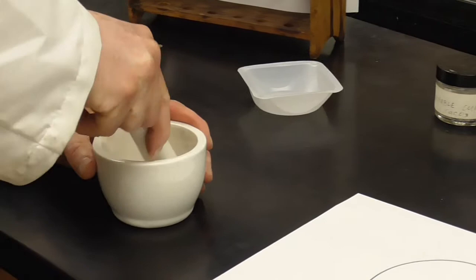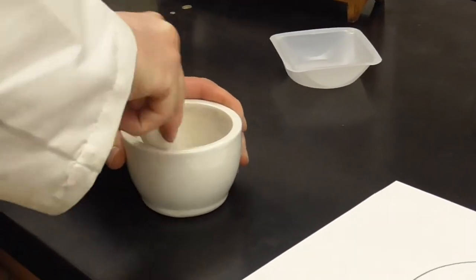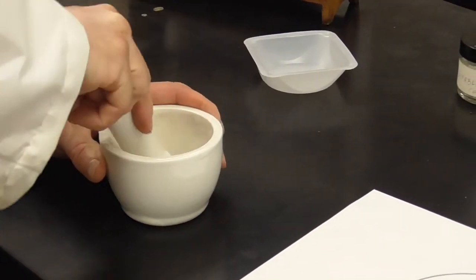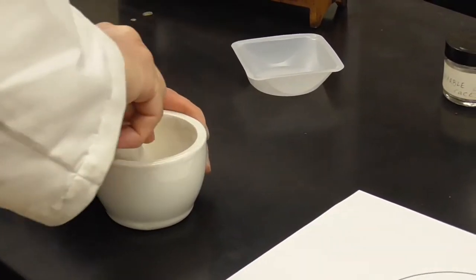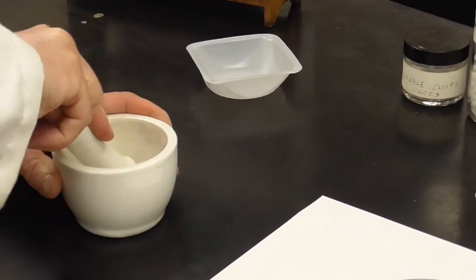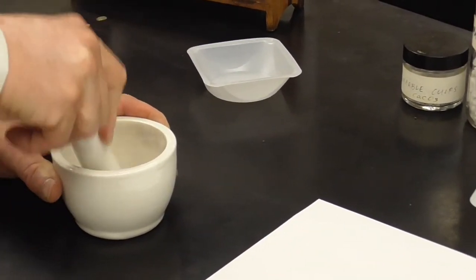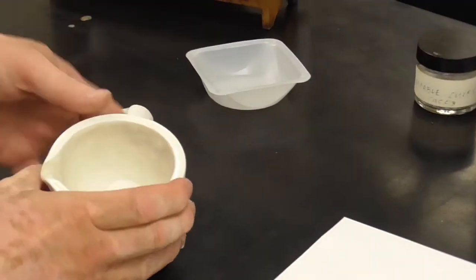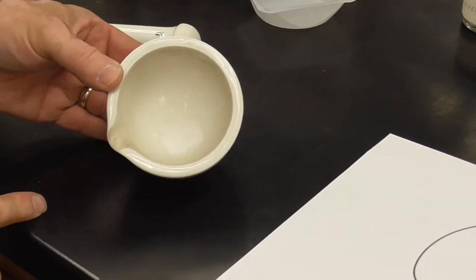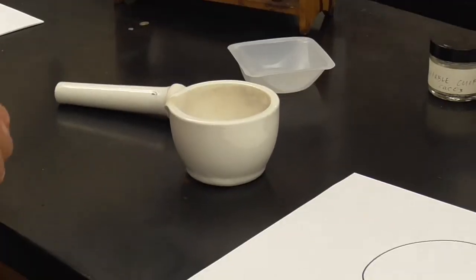You might have seen this kind of a picture like on movies or pictures of old labs back in medieval times or whatever. It seems to be a symbolic sort of a piece of apparatus, very ancient, very old piece. But there we go, and I'll tip it like that. You can see we've ground them up into a fine powder. Okay. And so there's a lot of surface area on that.